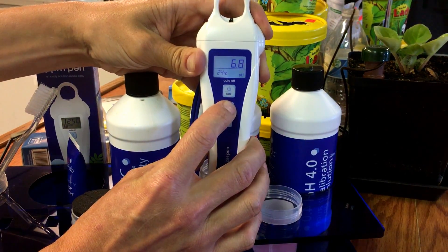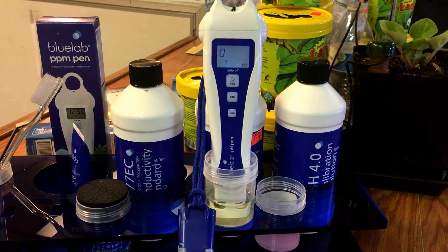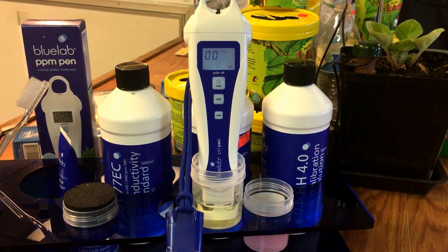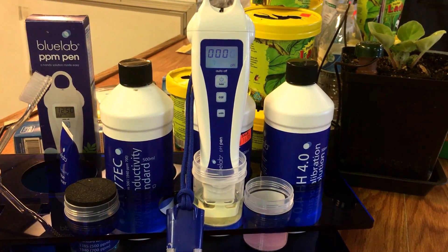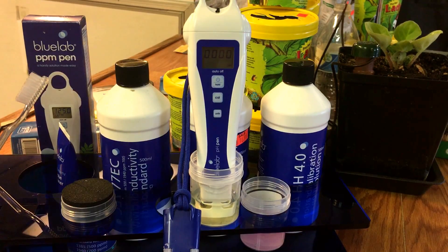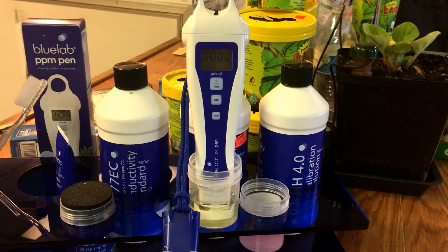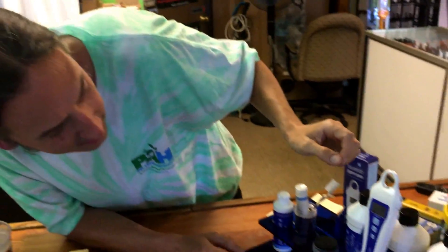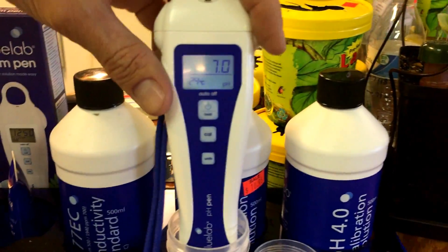You hold the calibrate button in, it goes into calibration mode, then you let go and just let it sit. Eventually it calibrates itself to 7.0 and uses that as a reference going forward. It's almost done — and it's now reading 7.0, so you're good to go. By the way, next episode we're going to cover the nutrient strength meter, so check back for that.